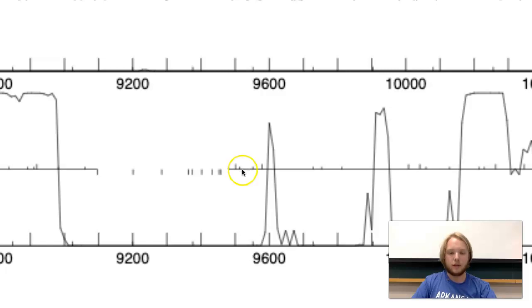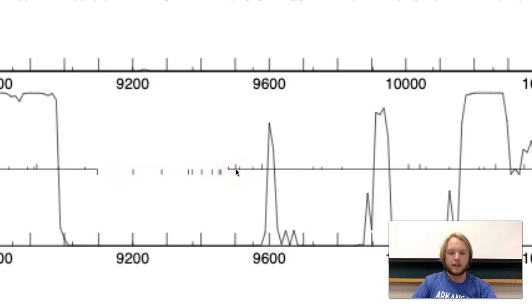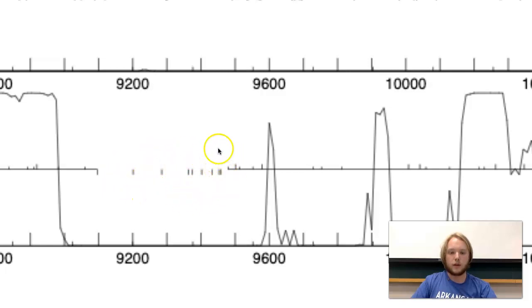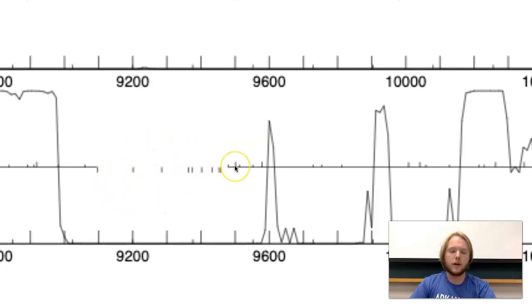Those upticks represent start codons. These downticks represent stop codons. As I explained earlier, stop codons only serve the function of stopping a gene. If you run into a stop codon, you will always be finding the end of a gene or it's just part of a filler sequence in between genes. These right here are an example of random stop codons in the middle of a filler sequence.